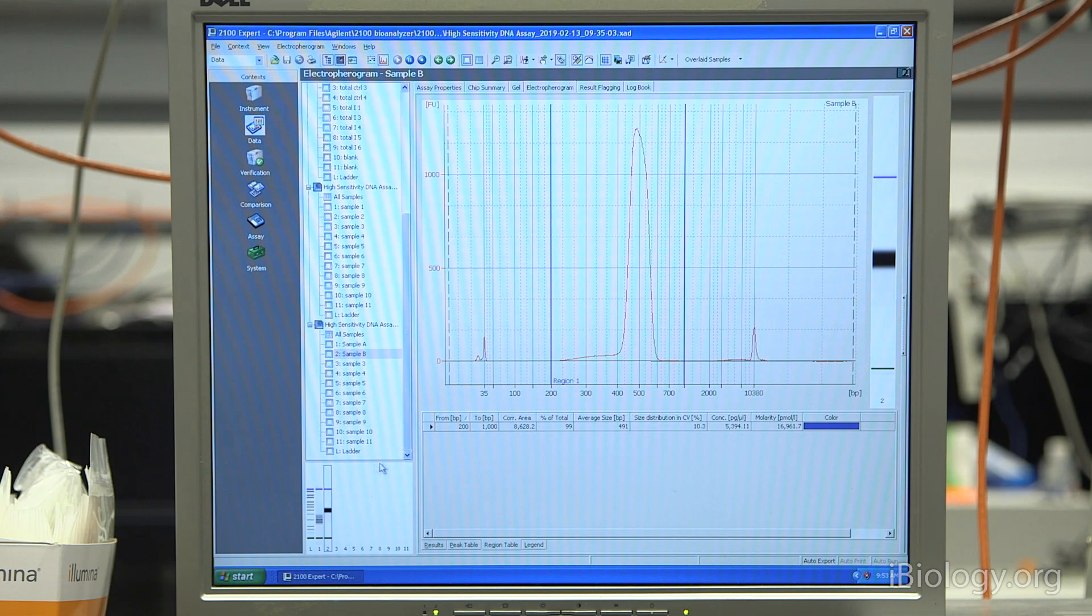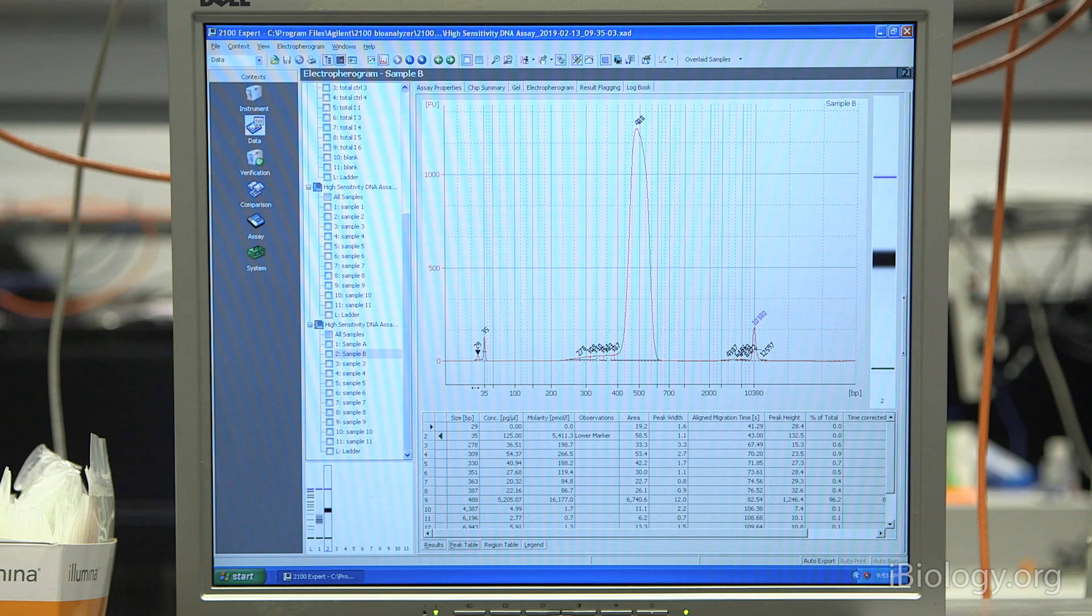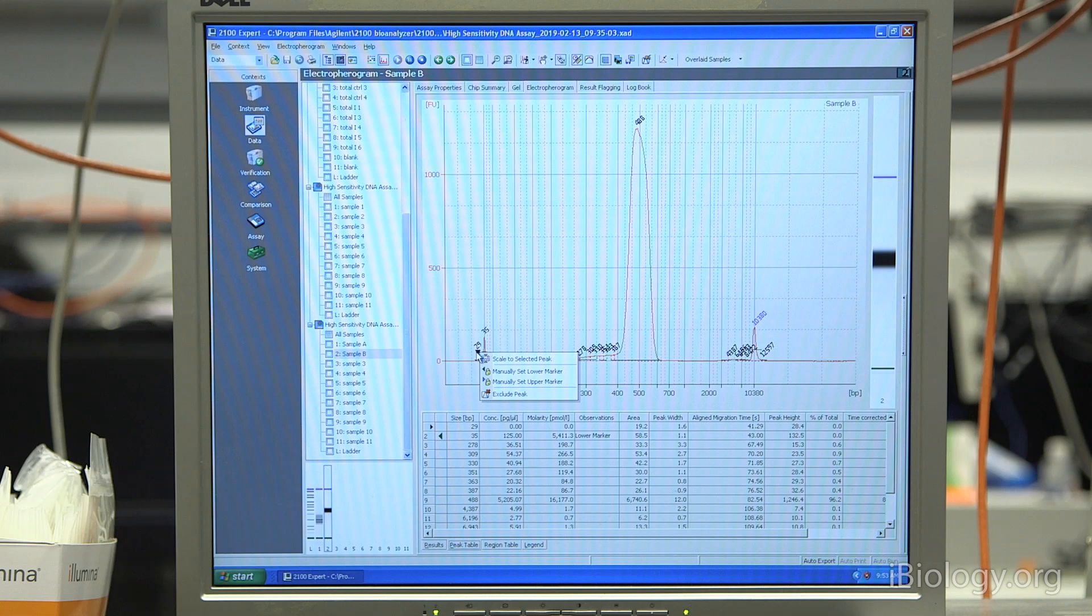Sometimes, the bioanalyzer won't detect your marker peaks correctly. You'll see a red flag or a red mark down here in this simulated gel image. This is something that's easy to correct by going to the Peak Table tab over here. For instance, on this sample B, we have this minor peak that showed up. Sometimes, this minor peak might get misidentified as a marker. On this peak table, what you can do is you can highlight over these peaks. Once you see a bullseye appear, you can right-click and manually set them as the lower or upper marker.